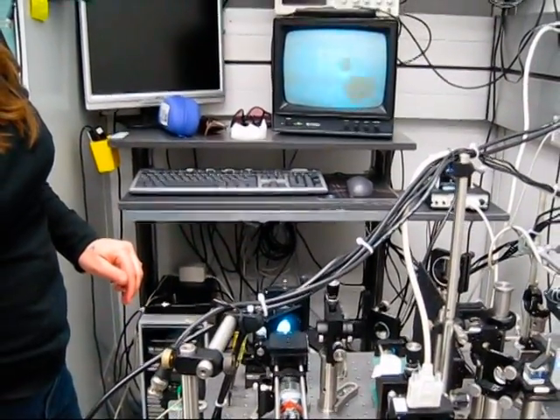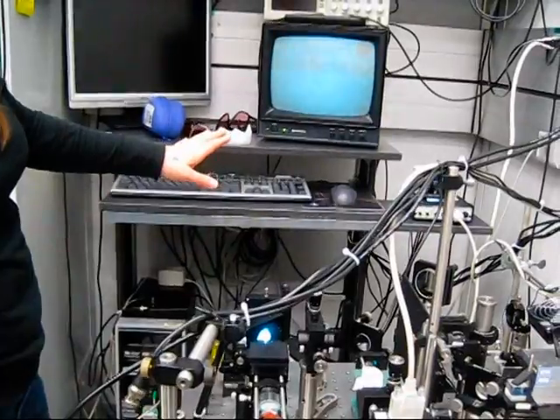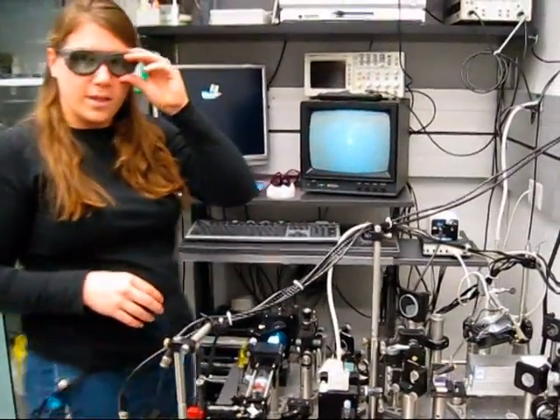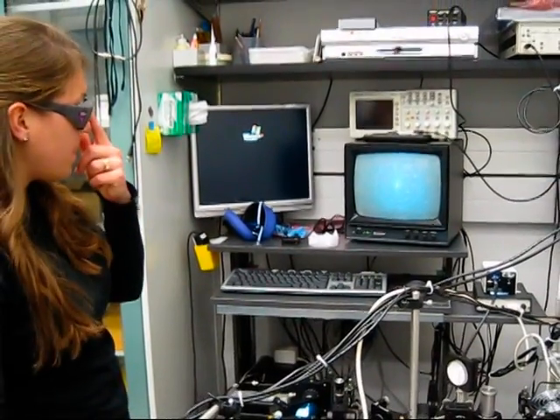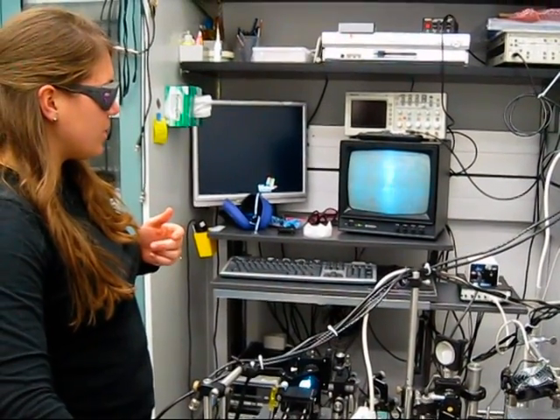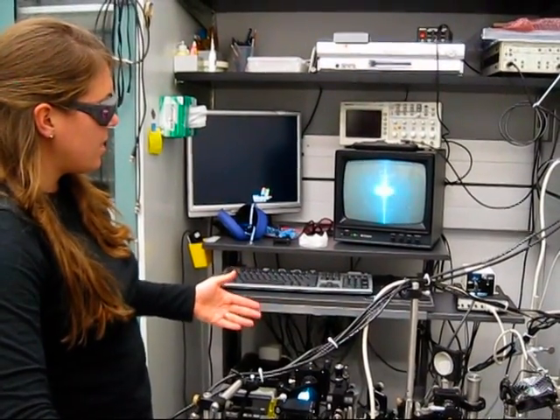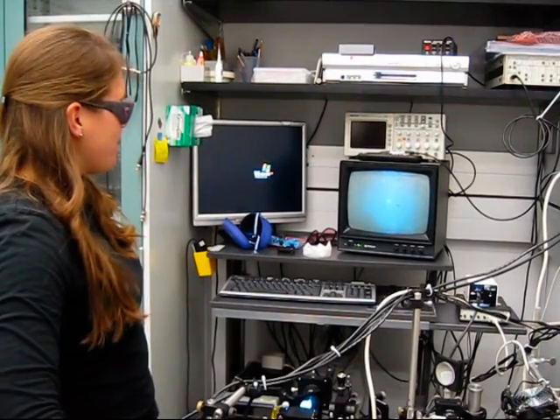Once I get it fixed, you can see there are beads floating around in the sample. So now I need to align my laser. You can see the reflection of the laser on the cover slip. The laser is coming in and getting reflected and going back to the camera. If I move the stage in the axial direction, you can see I'm moving it through the beam focus, so the reflection changes size. And miraculously it's still aligned from about a week ago.